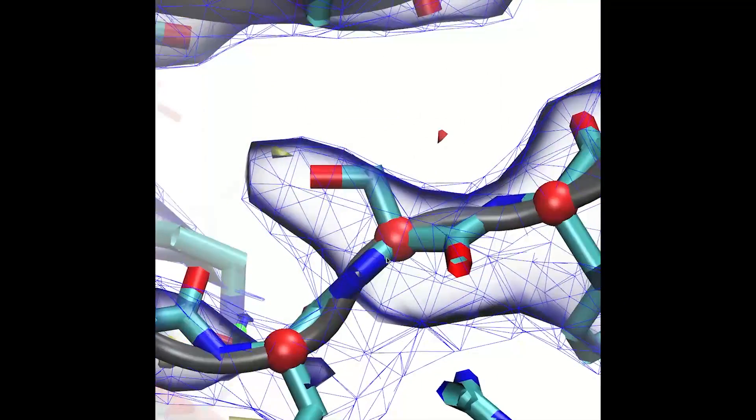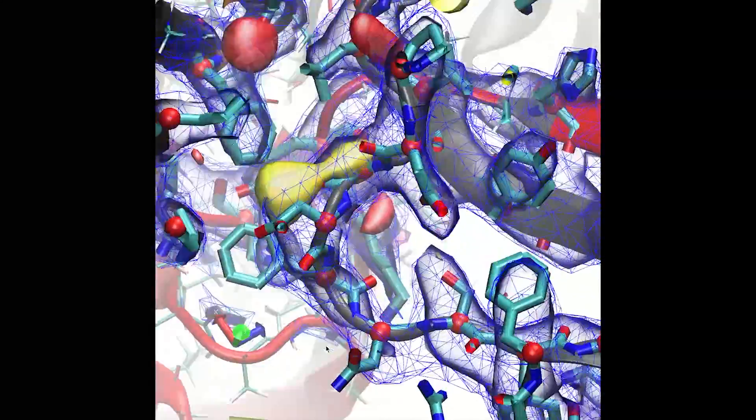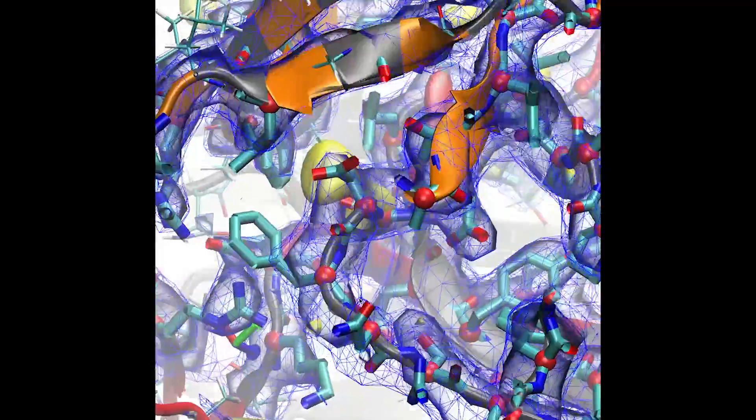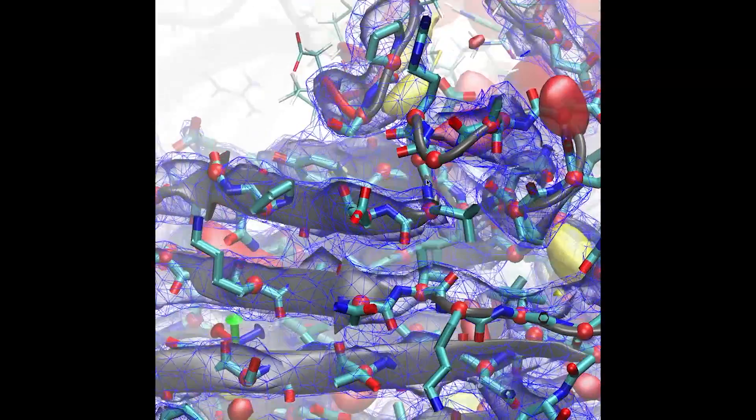Signs of error include underfilled density around the serine residue, a phenylalanine outside of density, two acids in somewhat hydrophobic environments, and signs of overpacking at the end terminus of the next beta strand back.